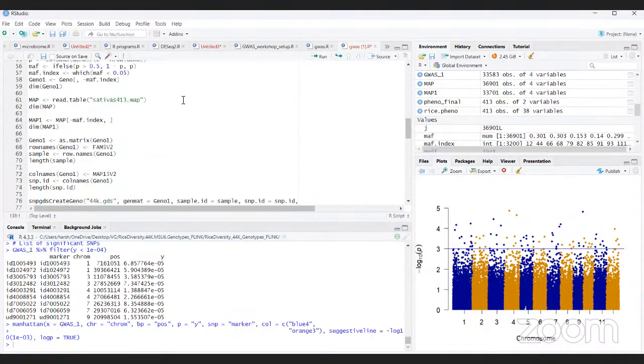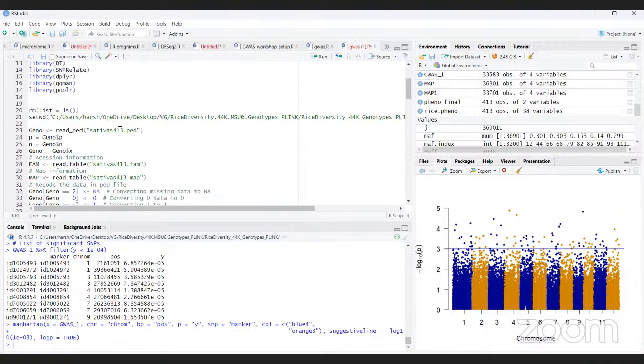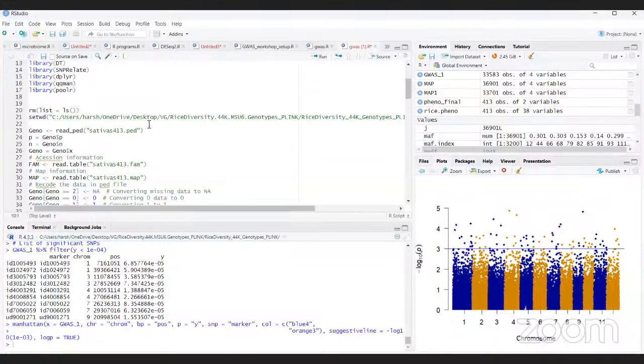So to give you a preview, guys, this is the actual R script that we use for processing real data. You have certain things that we have included here, and a few things are extra as well. So you can try out running PCA plots for this, and you can add or delete some parts of the code.